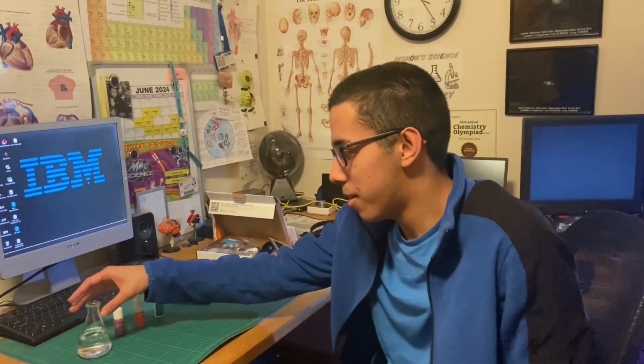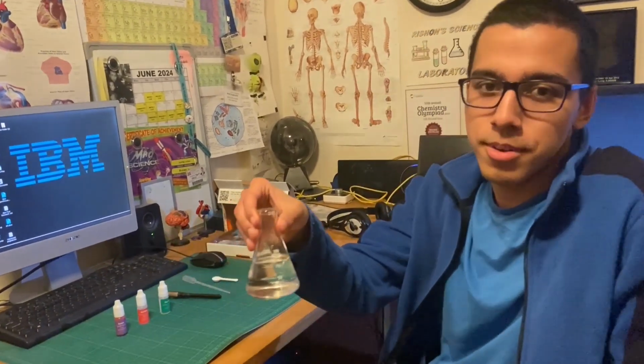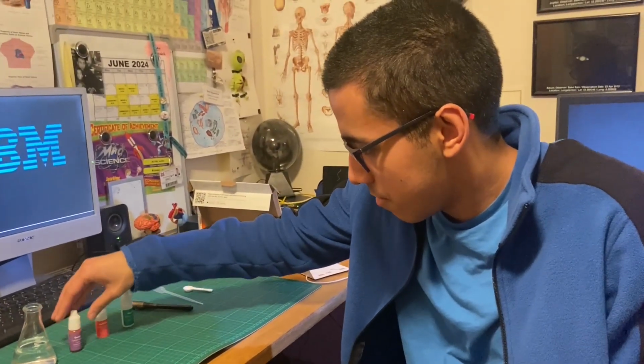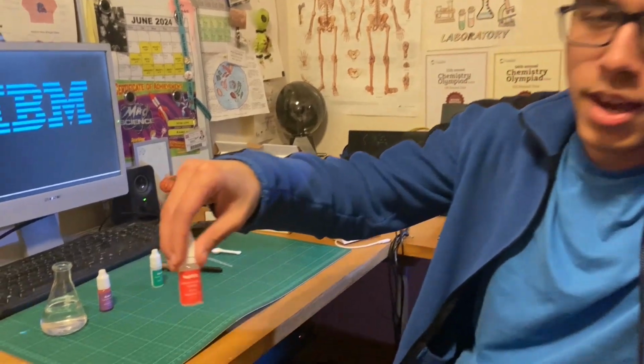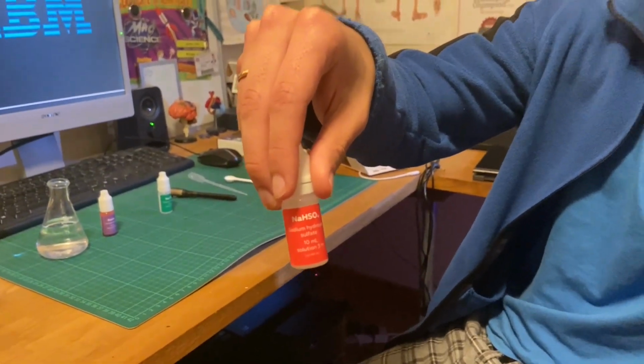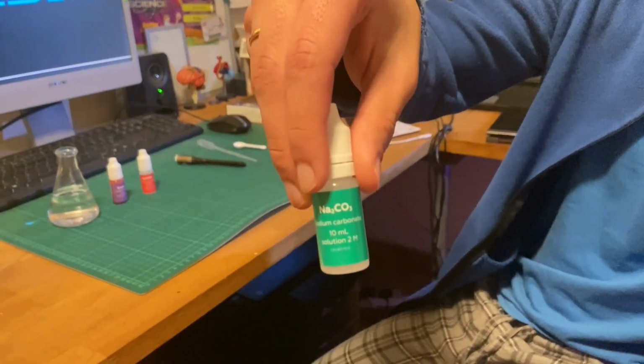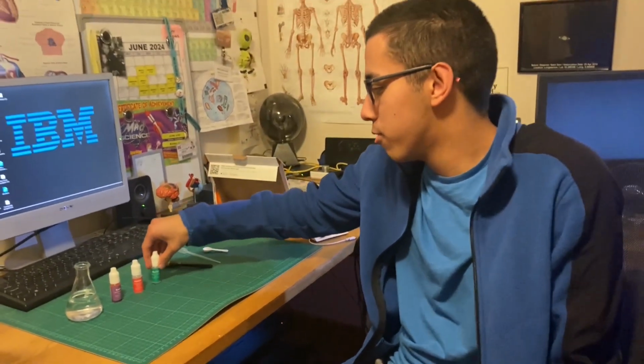In today's experiment, we will need 80 milliliters of water, a strong purple dye called eosin, sodium hydrogen sulfate, and sodium carbonate. And because we'll be dealing with fluorescence, we'll need to do this experiment in dim light.